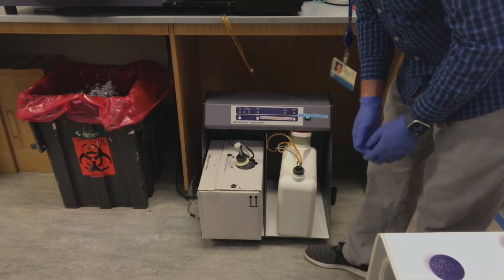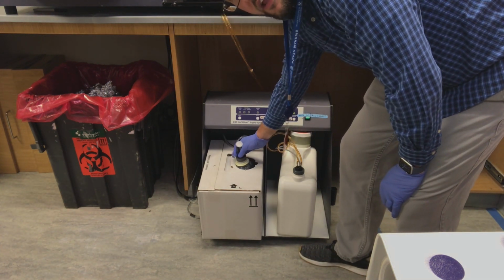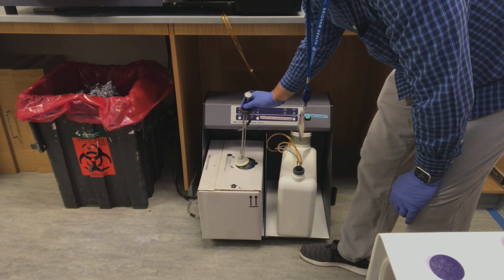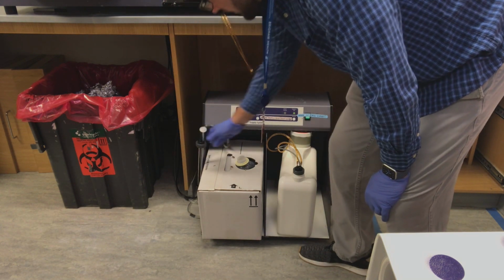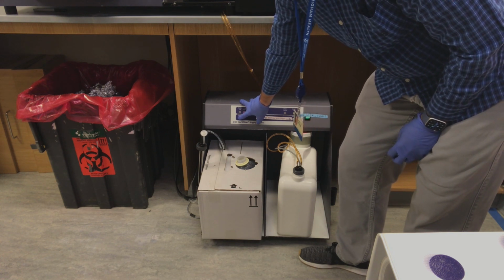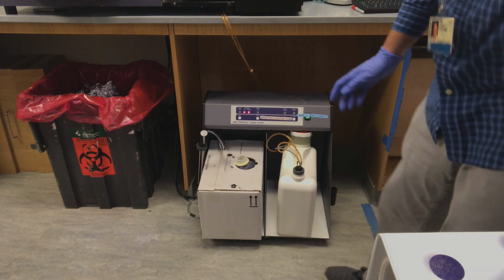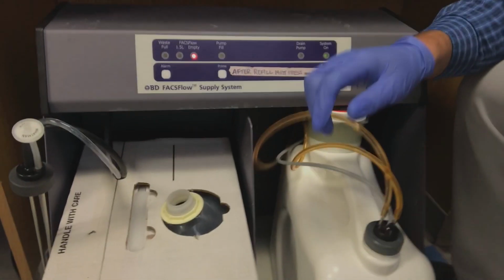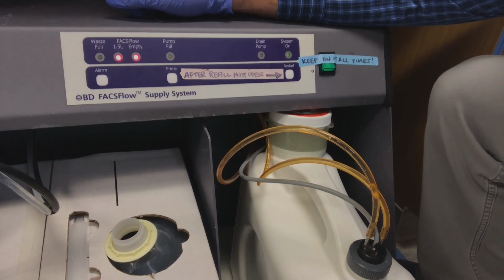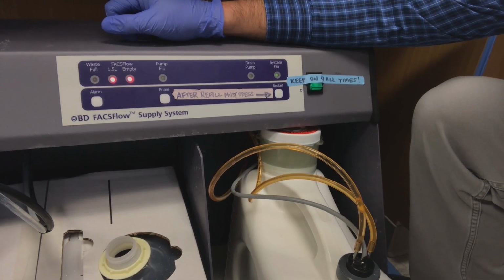In this case, as I mentioned, I will be replacing the tank itself. You can easily unscrew this, and what you'll hear is an alarm that goes off, notifying you that the tank is empty. There's a little holster on the side for the probe. Now there's a button on the waste tank that silences that very loud, annoying alarm. But what I'm not sure you can see, I'll try to get up close, is the two alarms right here are still going off. We'll get to that in a minute, but it's the most important step to remember in the maintenance process of this machine.